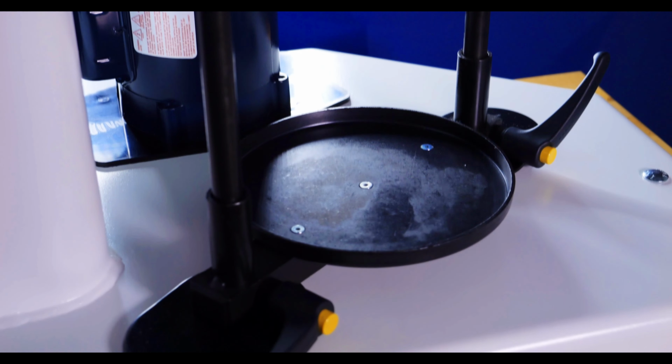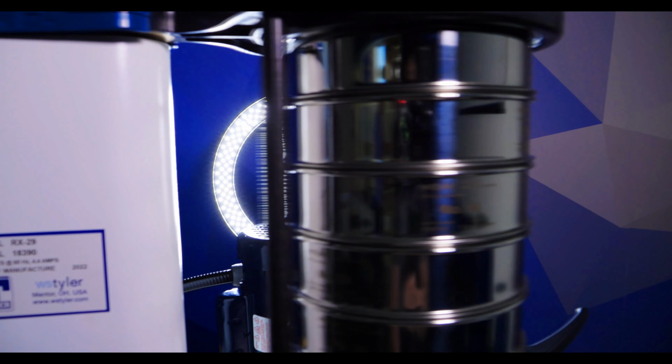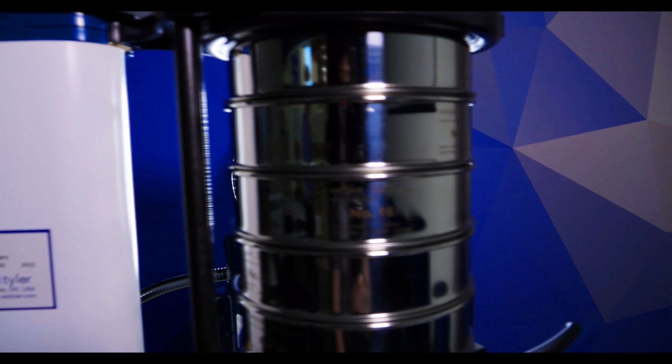Beyond standards for your sieves, your sieve shaker itself can also be noted in your industry standards. Sometimes you'll be required to use a sieve shaker of a certain caliber that uses a distinct type of motion. If you don't know your industry standards, you can find yours by going to the ASTM website or ISO.org. The standards will include if you need a sieve shaker, what motions those sieve shakers need to perform, and it will also list the performance specs you should look for.